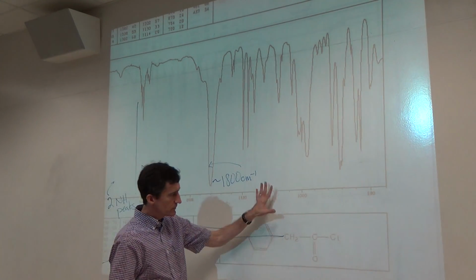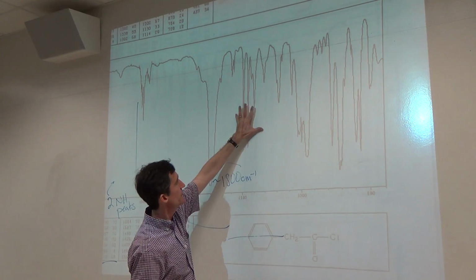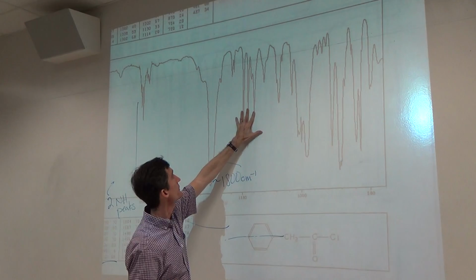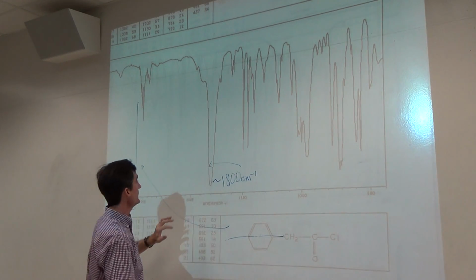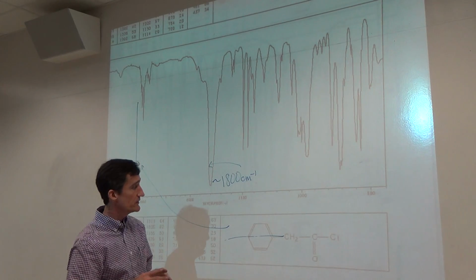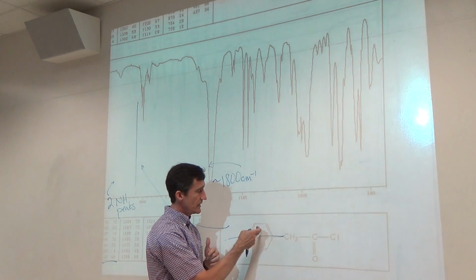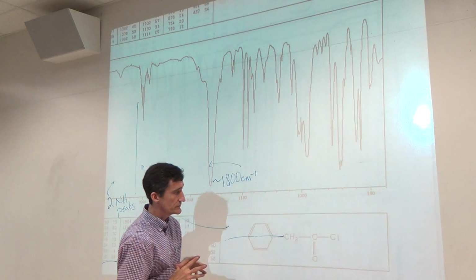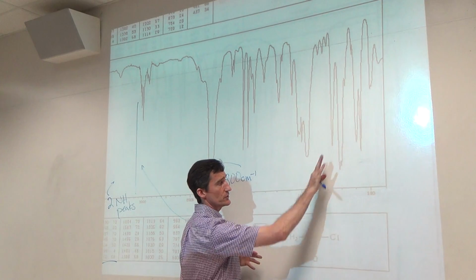Compound below, similar example, you can look at this. It does have an aromatic ring, and so we've got these peaks at about 1500, 1600. Carbonyl high, and then we should have peaks on both sides of 3000 because we have sp3CH and also sp2CH. Of course, the C single bond chlorine is going to be fingerprint.